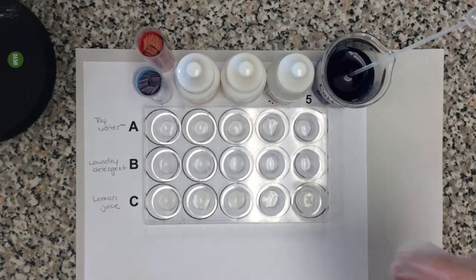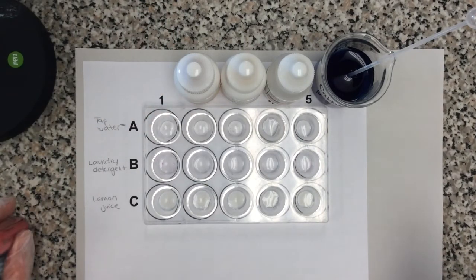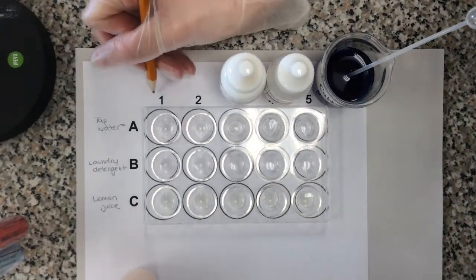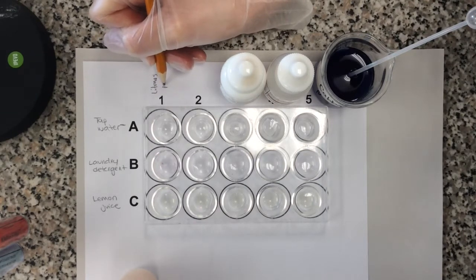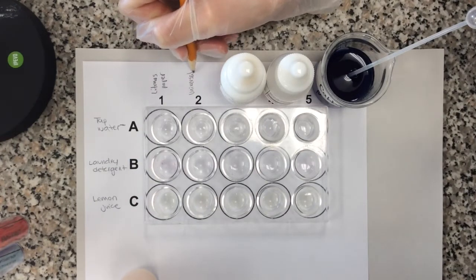So I'm going to go ahead and write those down at the top here so that I can keep track of that as well. I don't want to forget. Litmus paper, universal indicator.